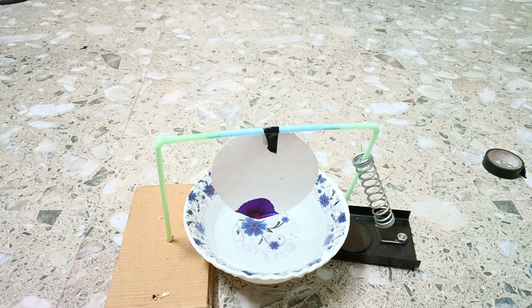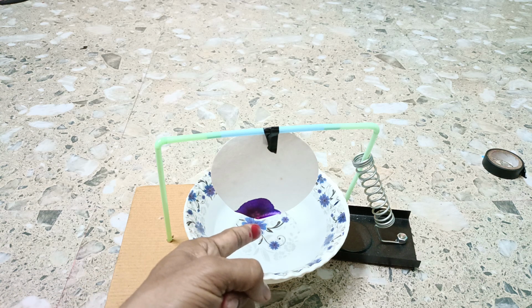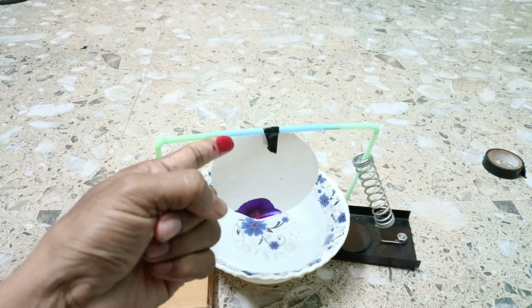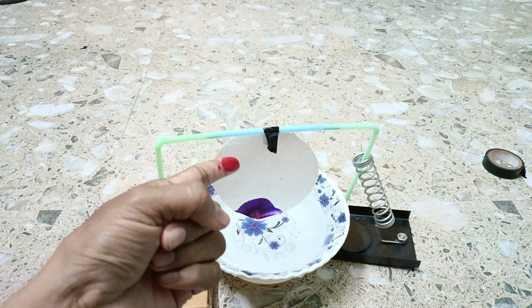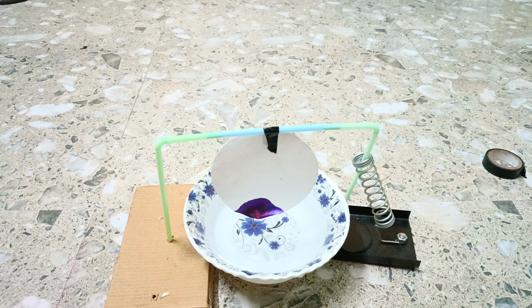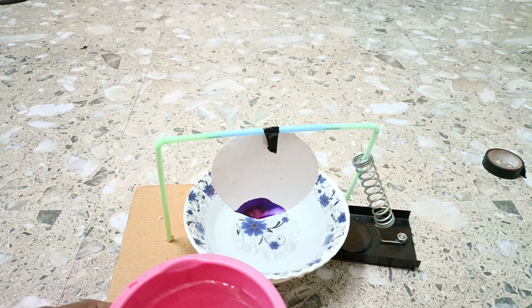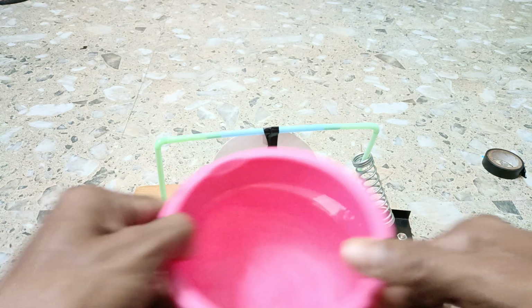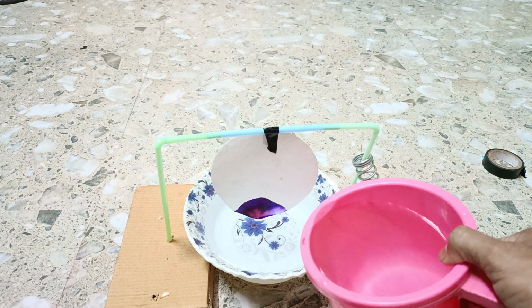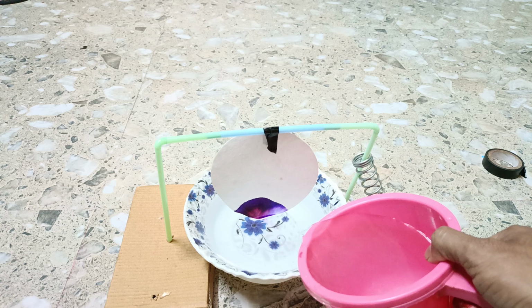You can see that this paper is absorbing water from this bowl, and you can see how it moves up the paper. As it moves up the paper, the blue color and red color will separate, and this is known as chromatography. You can see how the color will be differentiated into blue and red color. Again we are giving some more water so that it may absorb more water, and as the color moves up, the color will separate out as blue and red.